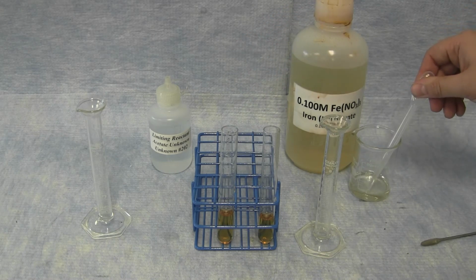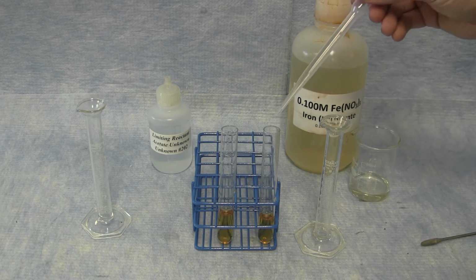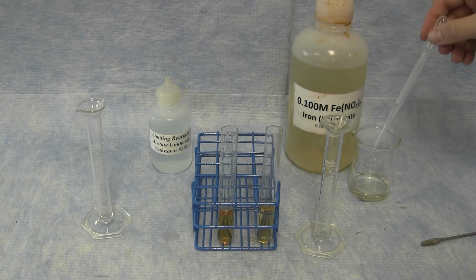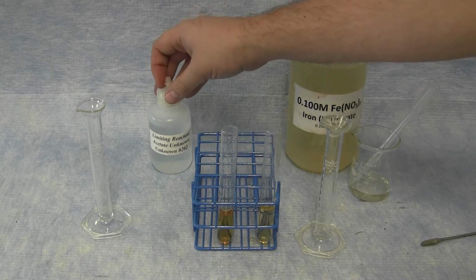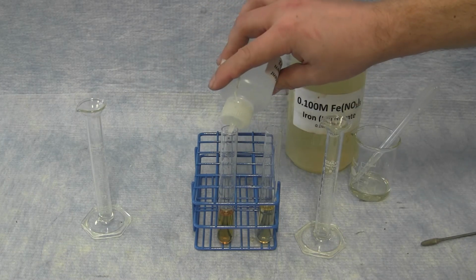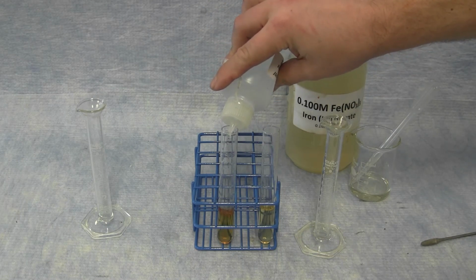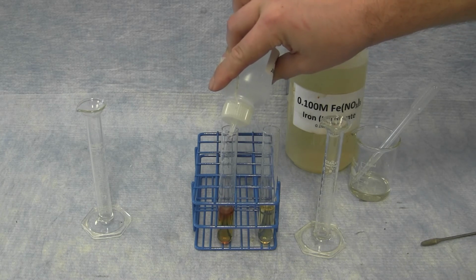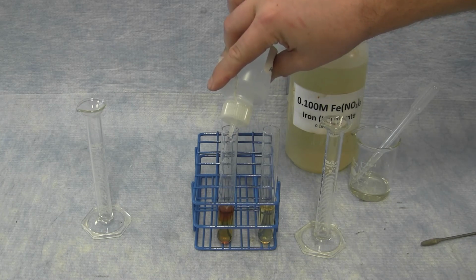To one side, you will add additional iron nitrate and notice any reaction or color change. And to the other side, you will add additional acetate unknown. The darker orange color indicates the formation of the product itself, iron acetate.